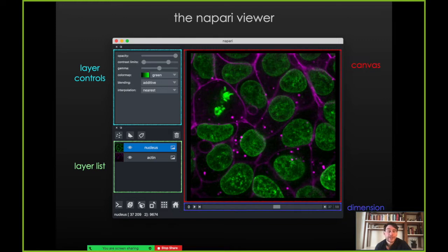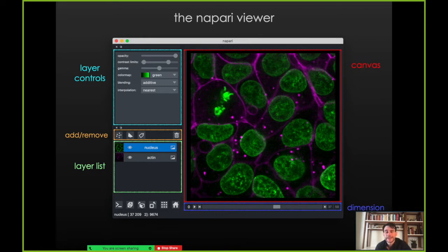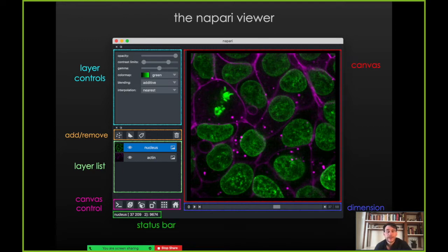We also have a dimension slider. This dataset is actually 3D and we're only looking at a single 2D slice of it right now, so we have an additional slider for that dimension. We can add and remove layers using buttons on the left. And we can control additional properties of the canvas, whether we're doing 2D rendering or 3D rendering, or which particular axes are being displayed with buttons in the bottom right. Finally, we have a status bar that can show information about where the cursor is or other helpful tips.